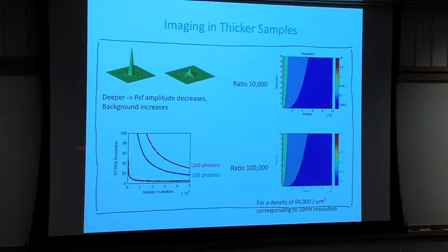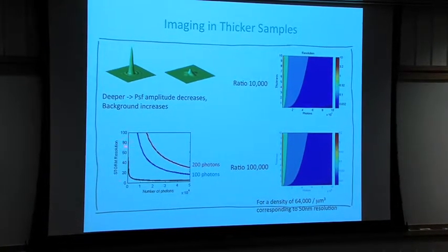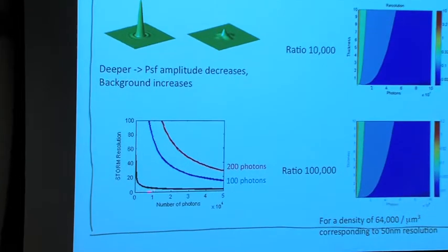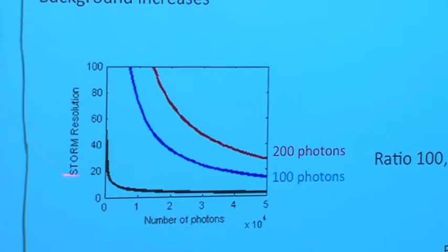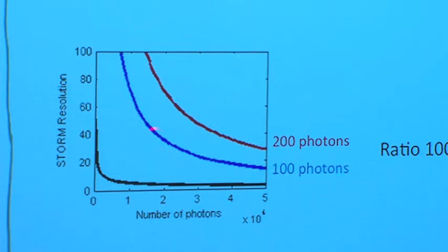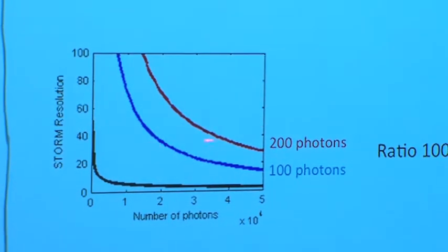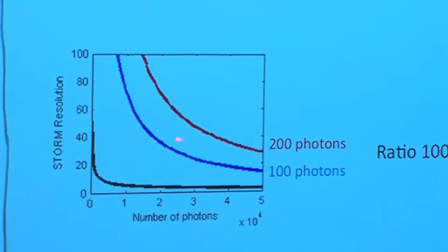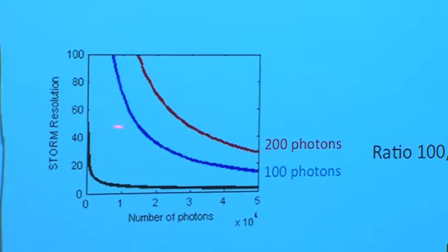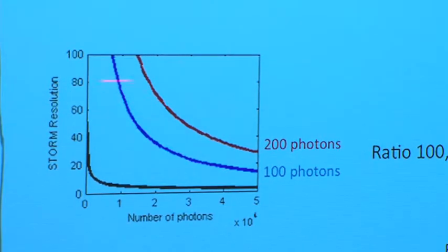And so that means that when you look at your photon statistics, here we're plotting the resolution you get versus the number of photons. If you have no background, you're on this black line, and with 10,000 photons, you can get sub 10 nanometer accuracy in the localization of the PSF. As you increase the noise from background photons, so if you have a fluctuation of 100 photons from other fluorophores that are out of focus in your sample, then that curve degrades rapidly. So with 10,000 photons, you're only getting maybe 60 to 80 nanometer resolution. And as the background noise gets worse, that resolution gets worse.